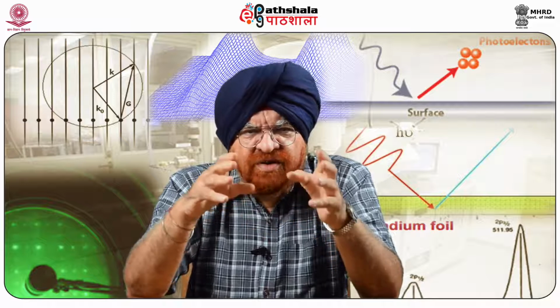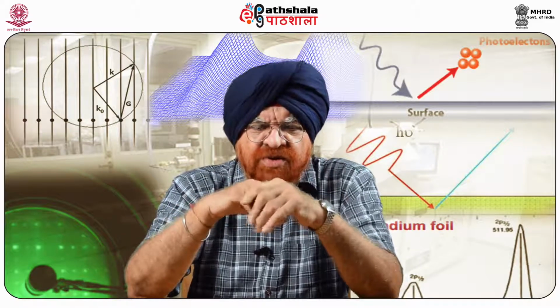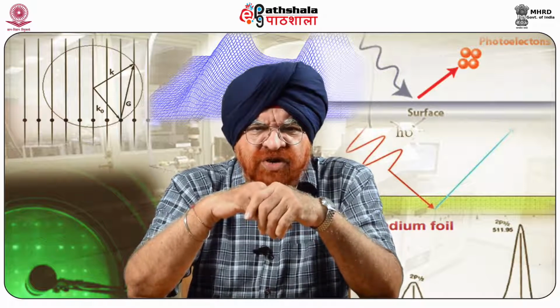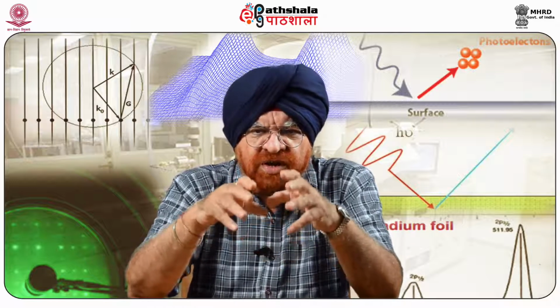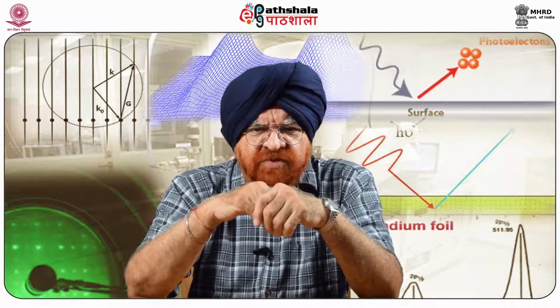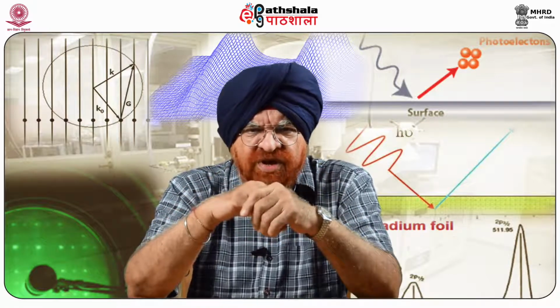We find we can use this in many facets, and let's summarize what we have learned in this module. The advent of the electrochemical scanning tunneling microscope has opened up the possibility of studying the structural development of electrode deposits in situ on a near atomic scale, which is extremely important. The principles of scanning tunneling microscopy, the incorporation of electrochemical cells, and the application of such instruments to electrocrystallization studies are reviewed very briefly in the earliest slide.